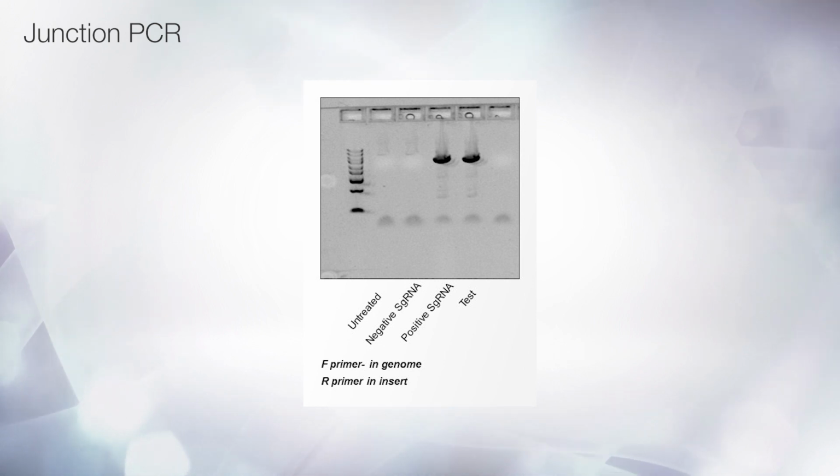Upon verification by junction PCR, our GFP beta-actin cell line is ready for experimental use.